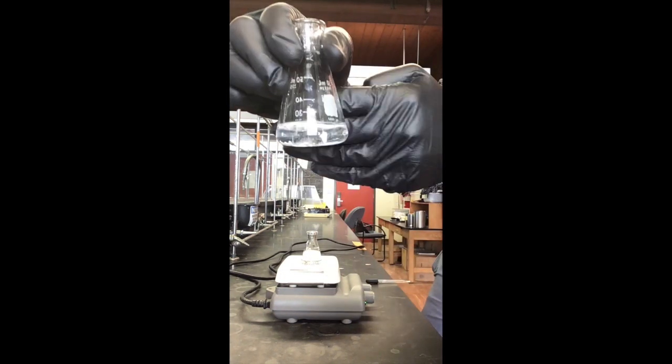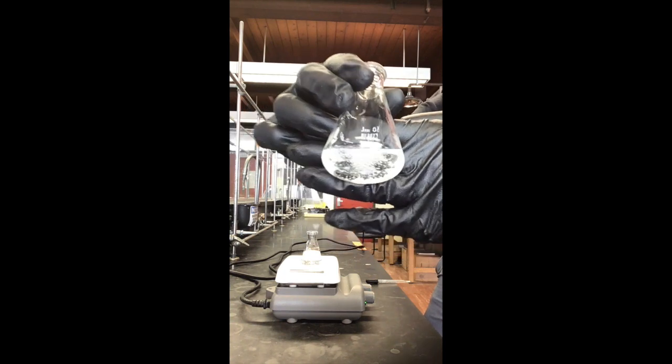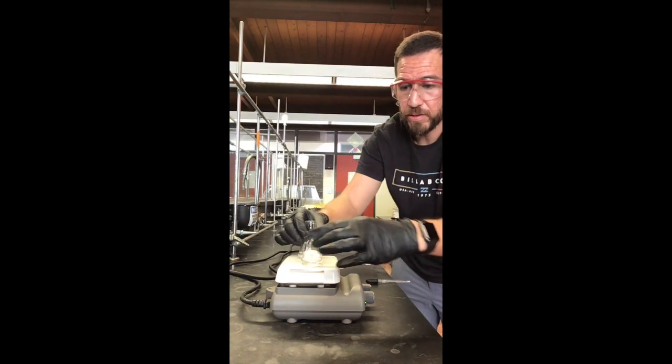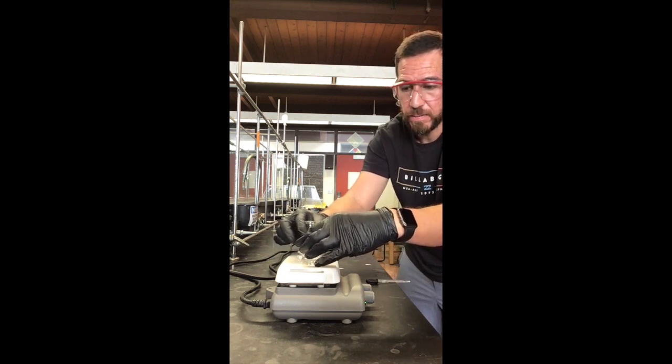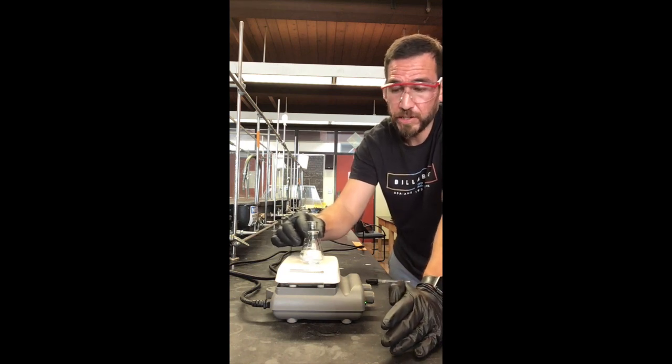So you can see that a lot of this material is dissolved. However, here, let me see if I can get you a nice contrast. There's a little glare, but there is still a little bit of material in there. So I'm going to go ahead and keep stirring this, and this is definitely something you just have to be patient with.